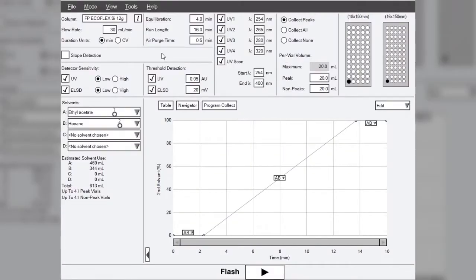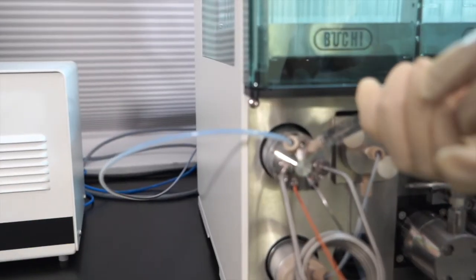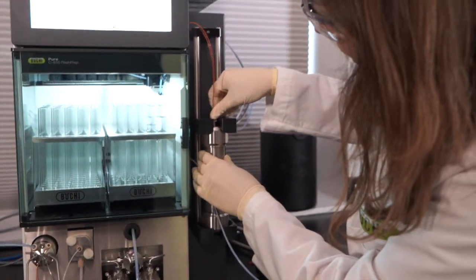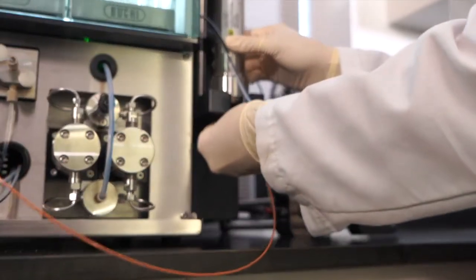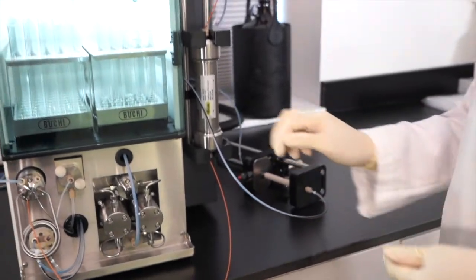If you're switching between flash and prep HPLC, change the column holder and install your column, enter your column name, flow rate, and design your gradient. Inject your sample by using the lower lock syringe. Any additional liquid larger than the loop size will drain into the waste. We offer various sizes of prep HPLC loops, 5 mils up to 50 mils.